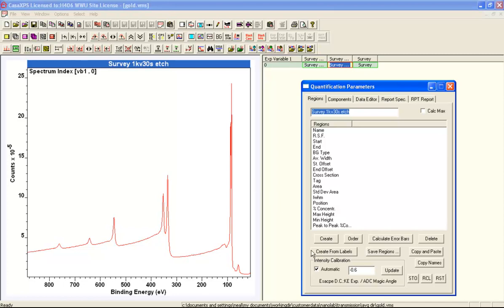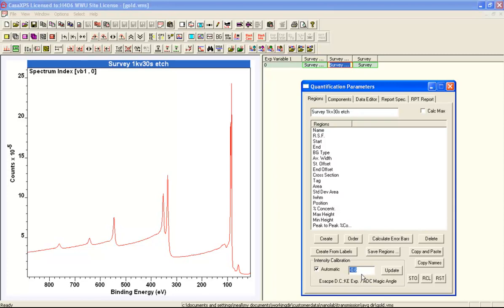We'll begin by looking at the escape depth correction. The escape depth correction is indicated here as being KEX. That means the exponent of a kinetic energy and the exponent is minus 0.6. This is the correction for escape depth as if the RSFs were Schofield cross sections.